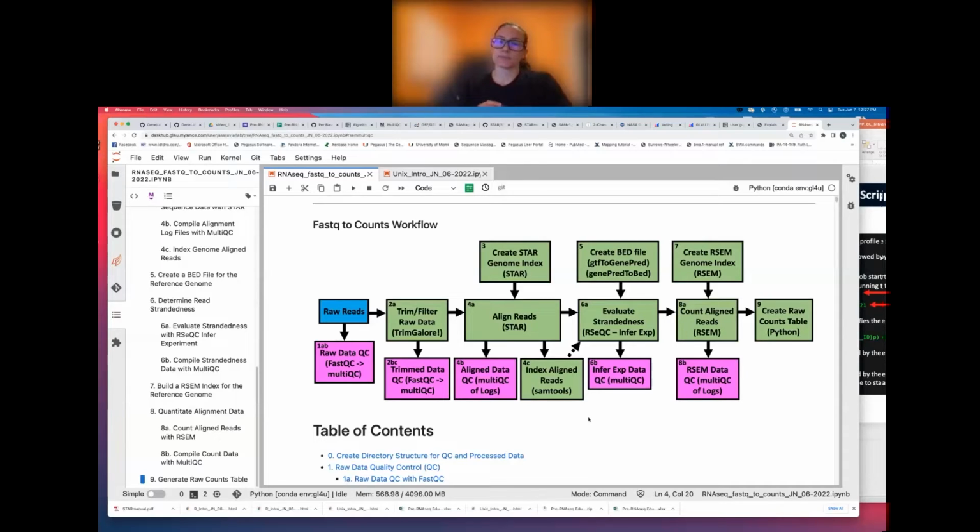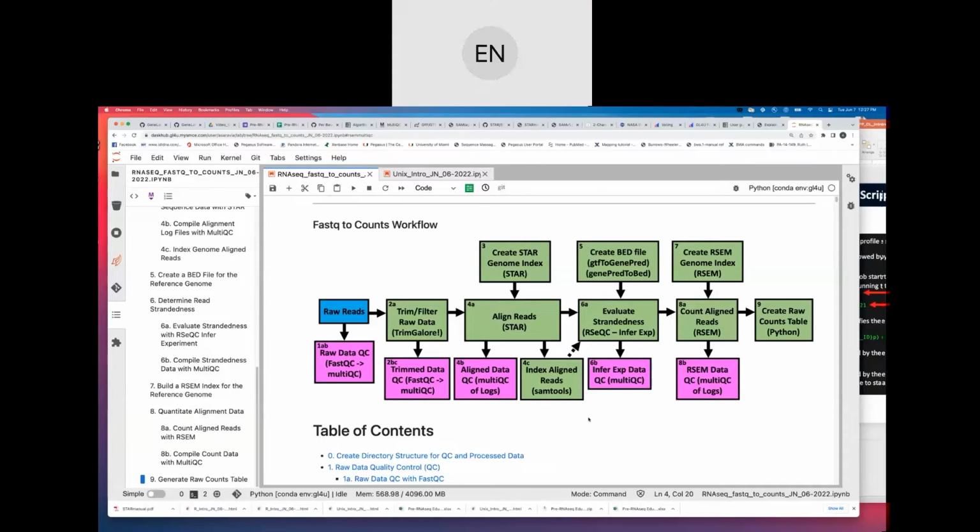Great. I mean, if it isn't too much trouble for me, I would love to see those, just for the sake of completion, STAR, RSEM, and so on.